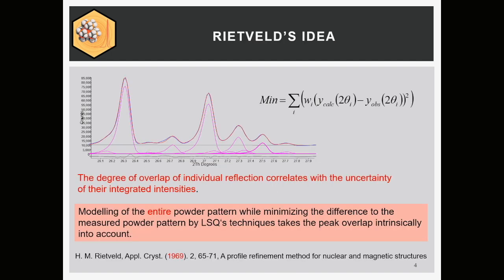It's written a little bit differently, but we are talking about powder pattern refinement, or basically Rietveld refinement, and so we have to talk a little bit about the idea Hugo Rietveld had. It was not only him, but he was, I would say, the main figure, and he wrote the most important papers on this.